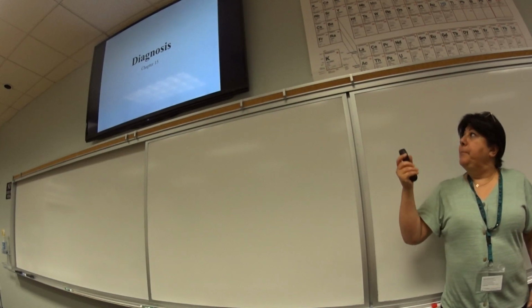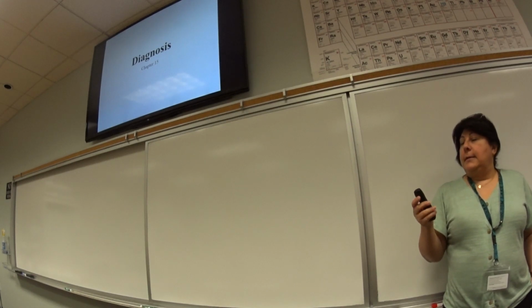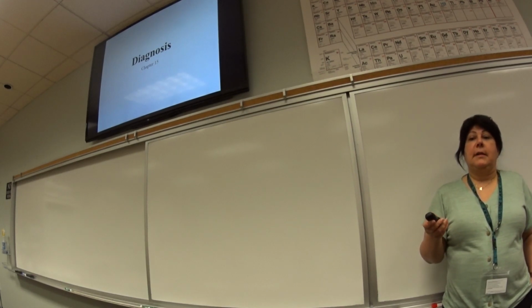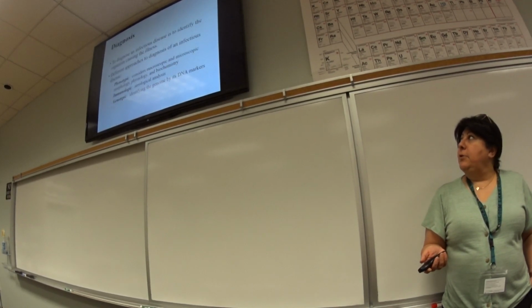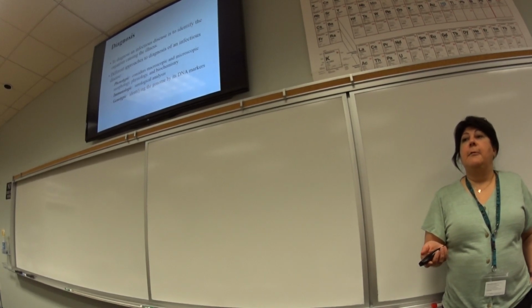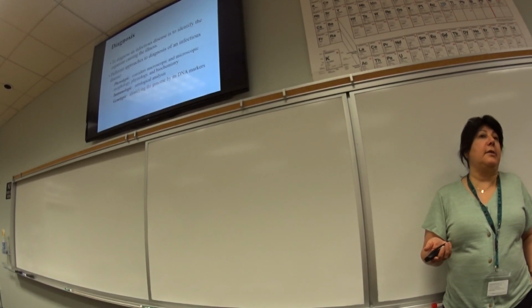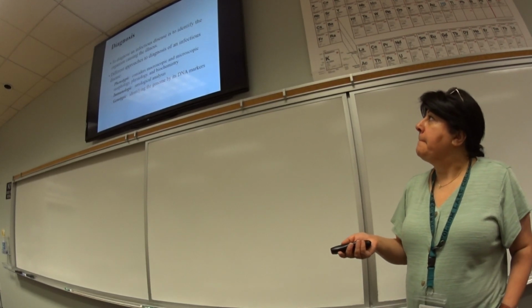This is chapter 15 from your book, which we don't cover. Chapter 15 was diagnosis. And why I use it is because what you're doing with your unknown is almost the same as what we do for a patient that comes in with an infection, where you want to diagnose and figure out what is the infection that is causing them the problem.